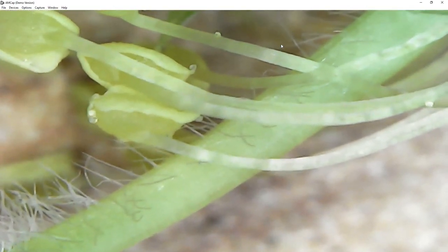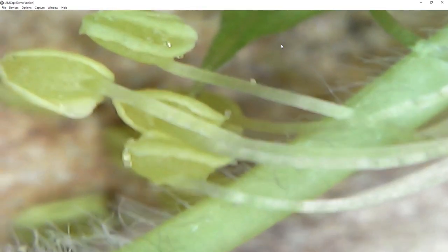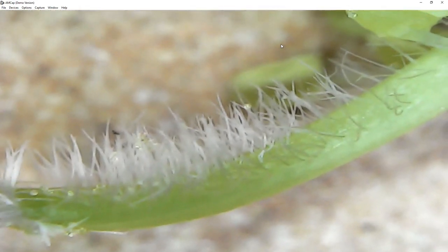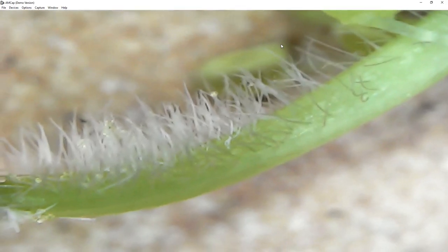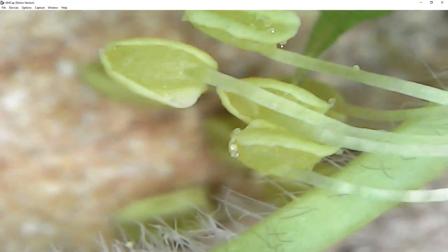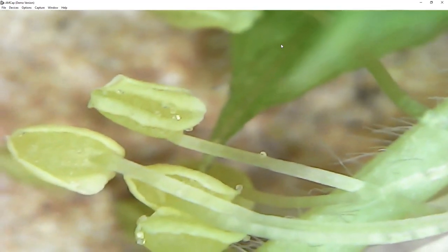You can try putting anything you want under this microscope. Here's a flower which clearly shows parts that you learn about in biology — the parts of the flower are so clearly visible. I think this is the part called the stigma. I kind of forgot all this, but yeah, this brings back old memories.